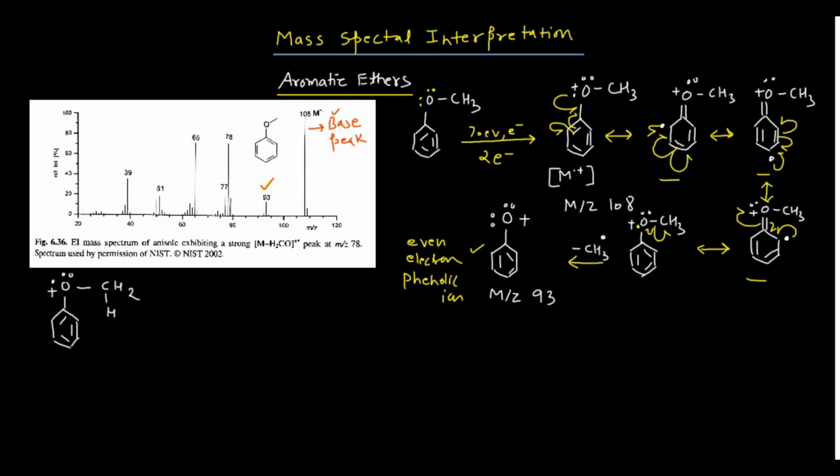So how can I form this? This is a very important fragmentation pattern which is given in some standard textbooks, and you need to understand removal of the formaldehyde molecule from here. So I'll remove the formaldehyde molecule from here. How can I remove the formaldehyde molecule? You see, now I am going to break this particular bond which is present between the carbon and hydrogen. You can break any of the bonds present between the hydrogen and the carbon atoms.